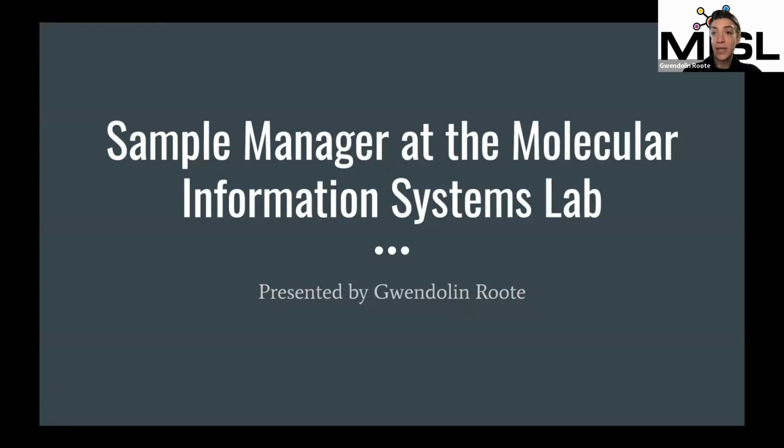And we are really happy with Lab Manager, Sample Manager, LabKey Sample Manager, and I'm going to tell you about some of the ways that we use it and how it's improved our research at the University of Washington.